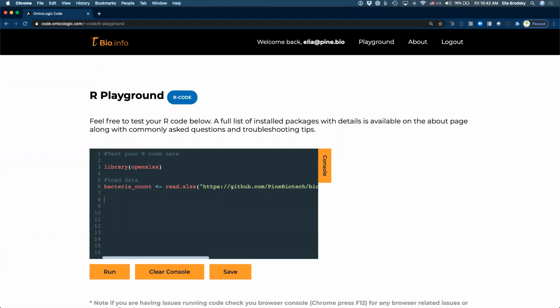I don't think that you need to have a GitHub account. Let me just make sure that this is public.